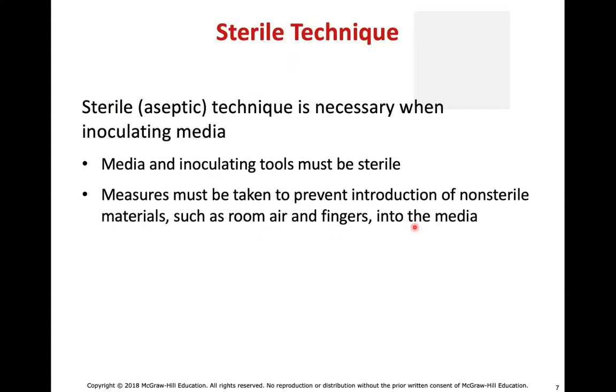Unfortunately, there can also be microbes and spores that travel through the air. And as a result, sometimes just by opening a plate, a spore or an organism may land on that plate, and that can cause contamination. It is very important that when you are culturing, you do not leave the plates just open, that you only open the plates when you are actively, say, inoculating it, and then you immediately close it. You just don't want to leave a plate open on a lab bench because it will open up the door for contamination.